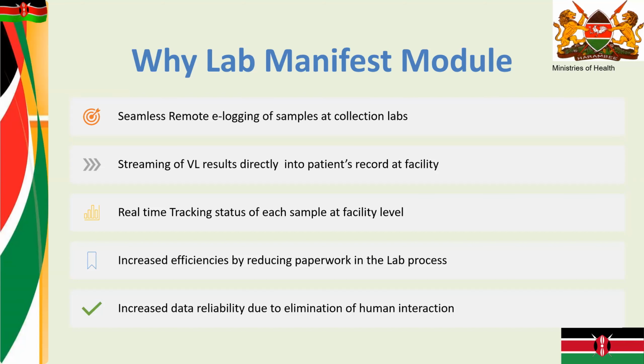And when the results for the viral loads are out, the same module is able to go to the EID database, pick the results for a specific patient, and save that in the patient record.